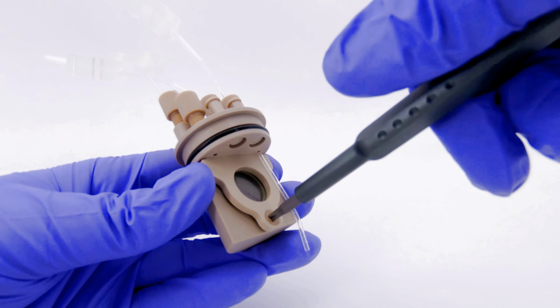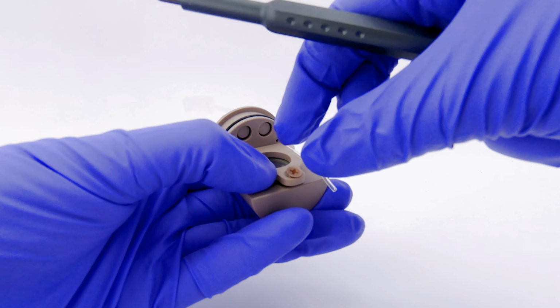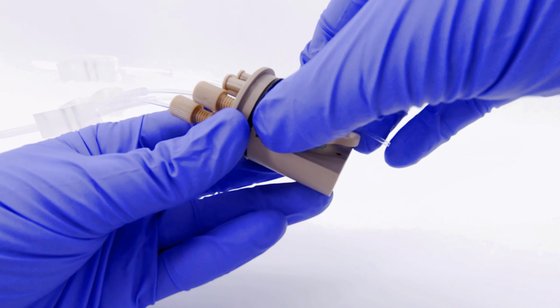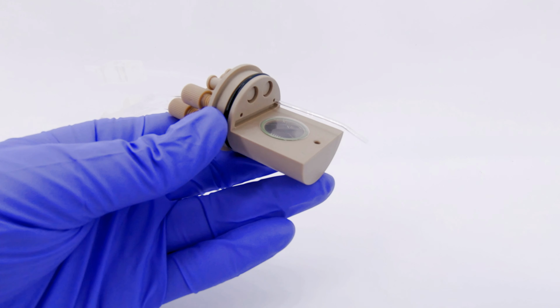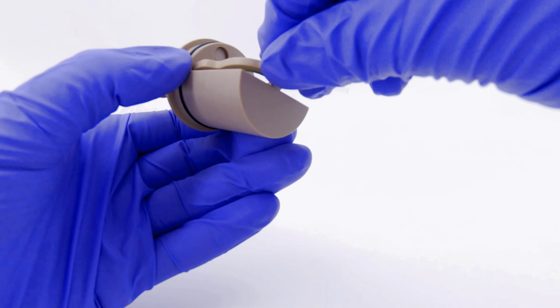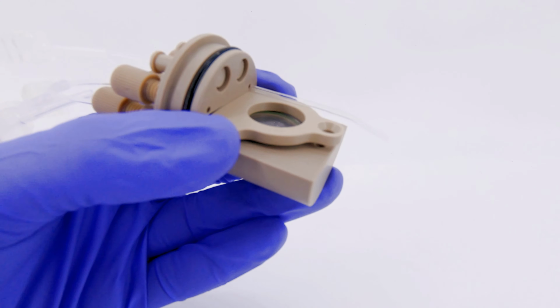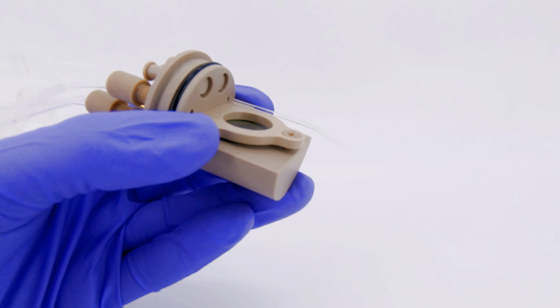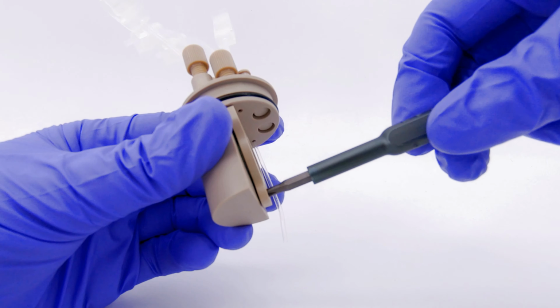If there's ever a need to swap or change the membrane, simply unscrew it, lift out the membrane holder and replace as needed. When you're screwing it back, ensure that the plate aligns parallel to the body.